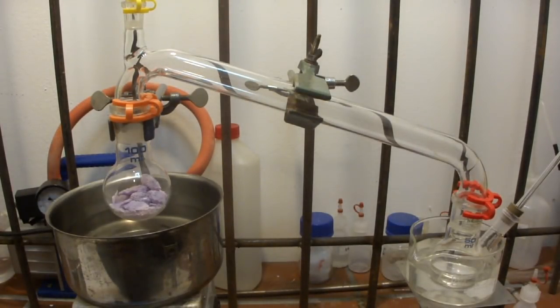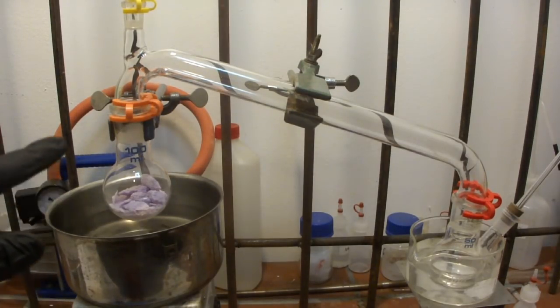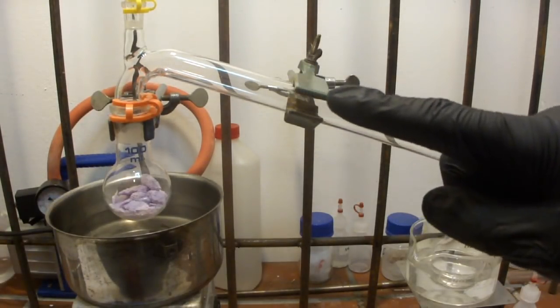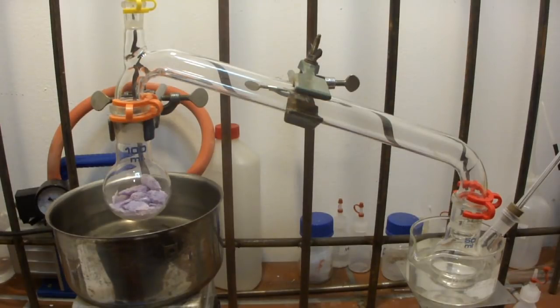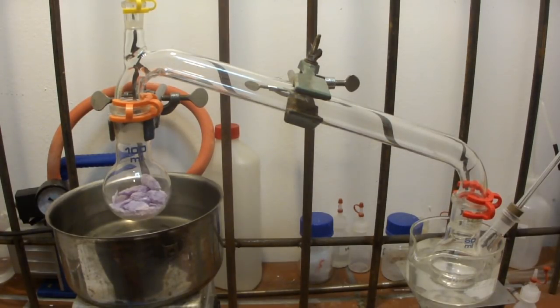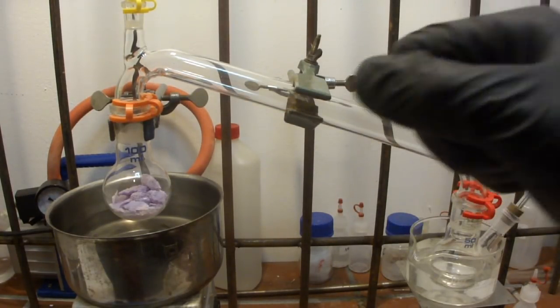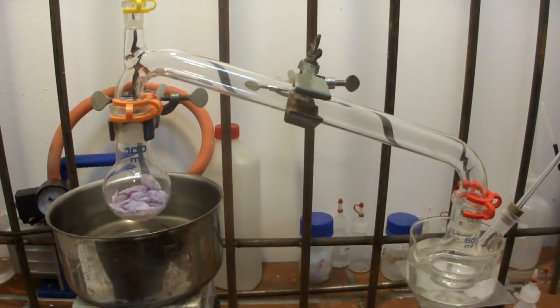So because trioxane melts only at 62 degrees centigrade, we have set up a slightly different apparatus than normal. So we have our regular flask right here with a stir bar, and then we have simply gone ahead and used this distillation bridge as a condenser. So there's no Liebig condenser or similar condenser, so this will only be air cooled. And you also have to get a heat gun ready, since the trioxane will initially solidify in this tube. So you have to use a heat gun and melt it down so that it can drip down into this flask, which is also cooled in a water bath.